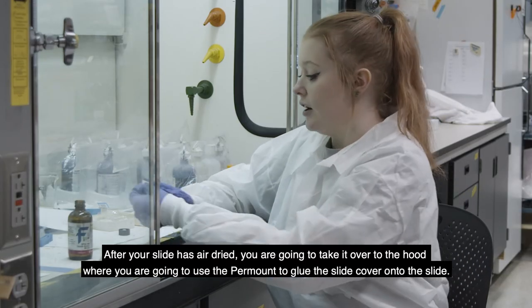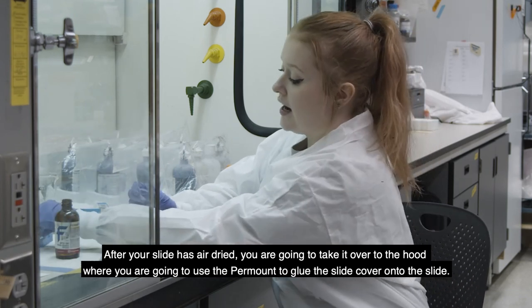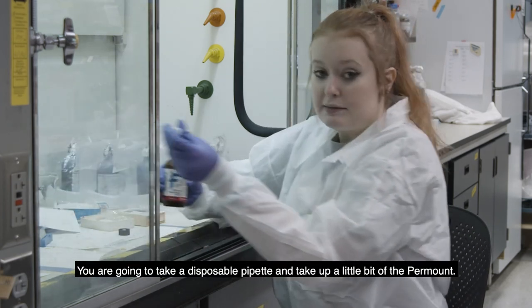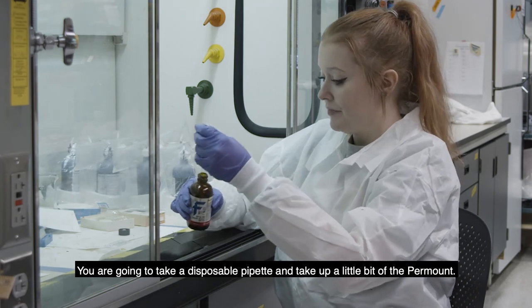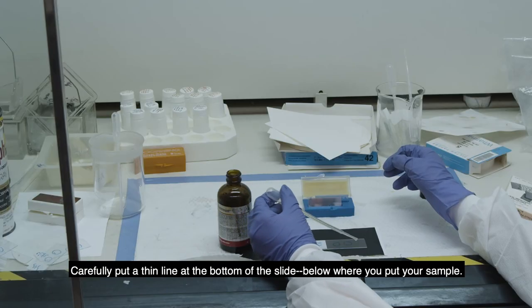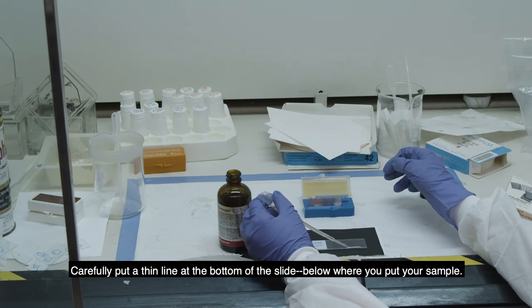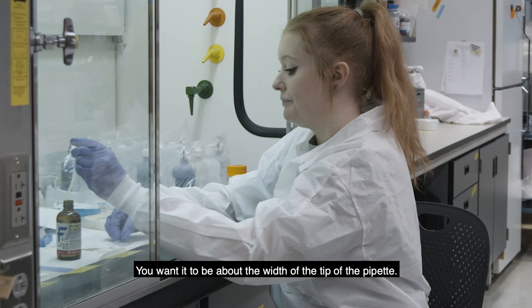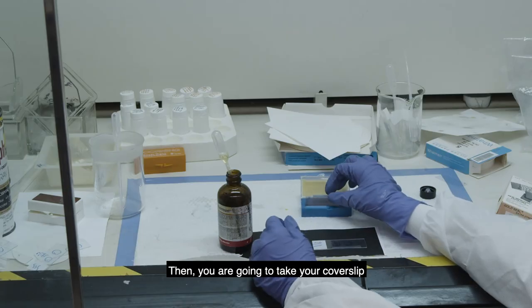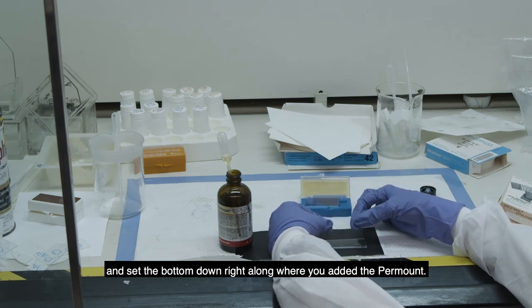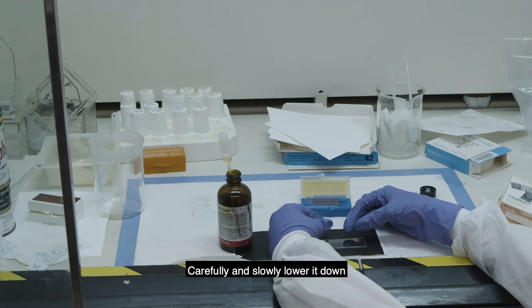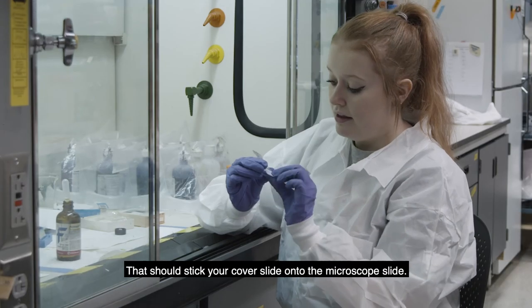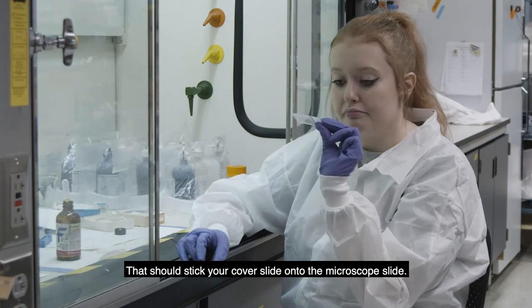After your slide has air dried, you're going to take it over to the hood where you're going to use the Permount to glue the slide cover onto the slide. So you're going to take a disposable pipette and then just take up a little bit of the Permount. And then you're going to carefully put a thin line at the bottom of the slide below where you put your sample. And you want it to be about the width of the tip of the pipette. And then you're going to take your cover slip and just set the bottom down right along where you added the Permount. And then carefully and slowly lower it down so you don't get any bubbles in between the Permount and the slide. That should stick your cover slide onto the microscope slide.